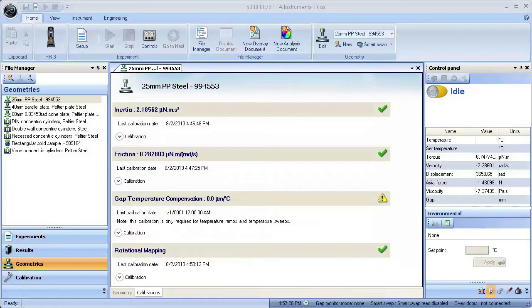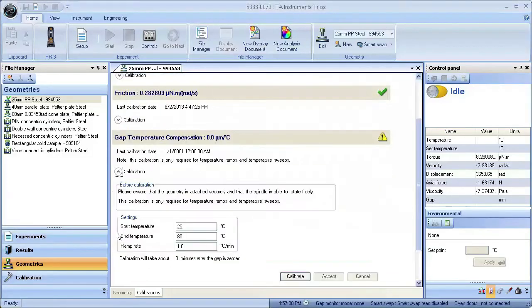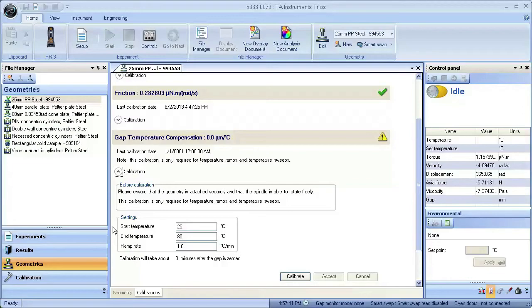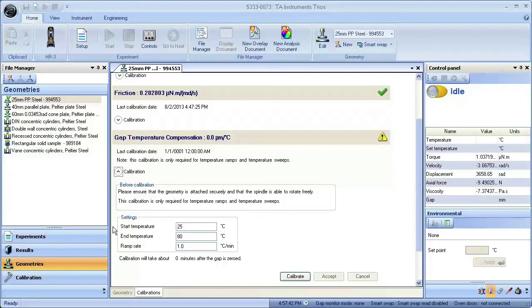There is an additional calibration that remains under the calibration window, Gap Temperature Compensation. Gap temperature compensation is important to account for geometry expansion during temperature ramp or step experiments. This calibration should be performed with no sample, but under the exact conditions desired for the experiment.